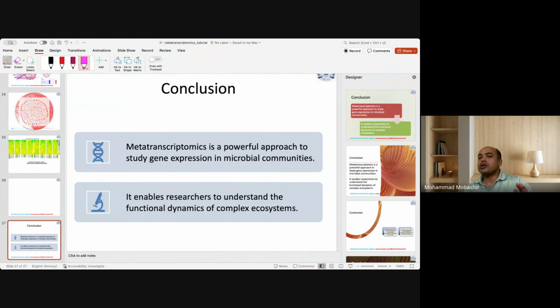Only one thing what you need to know is to understand the pipeline of metatranscriptomics and metagenomics and RNA-seq analysis for a well-defined organism, for example, human being. Then you will really understand and immediately perform the analysis if you have a really good configuration computer. And that's all. Thank you.